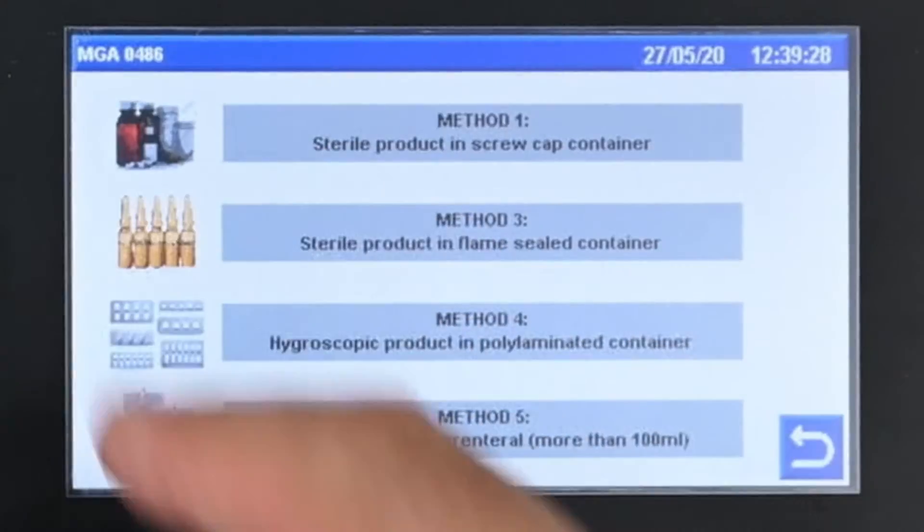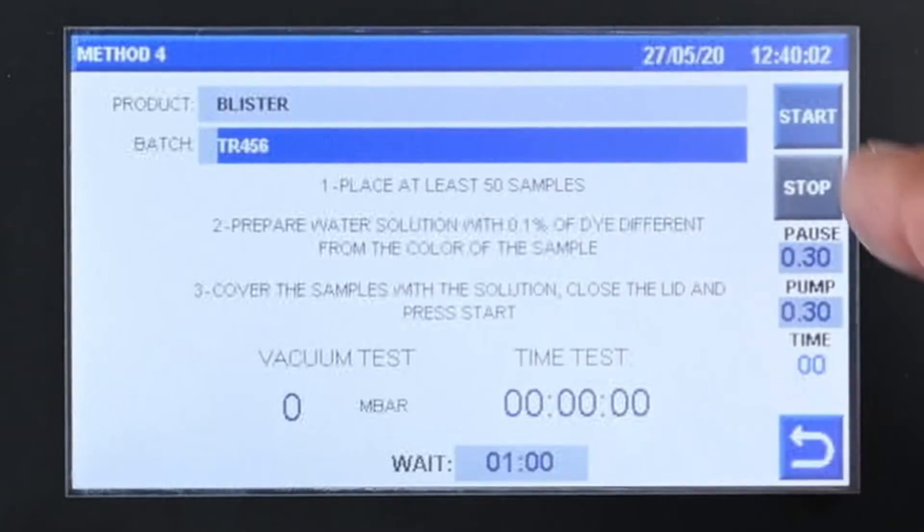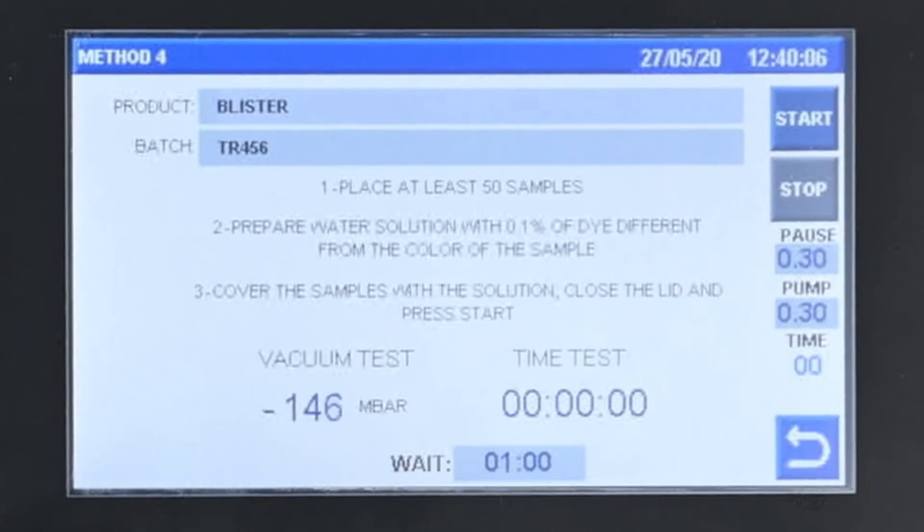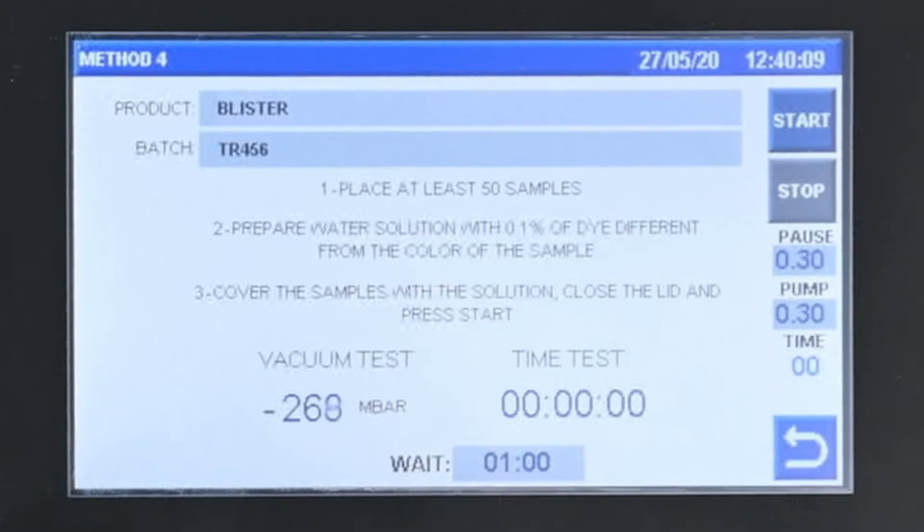Our applications will guide you through the testing process. Orion generates a vacuum at the speed and time required following the steps of the method of your choice.